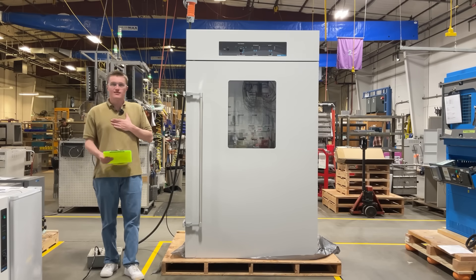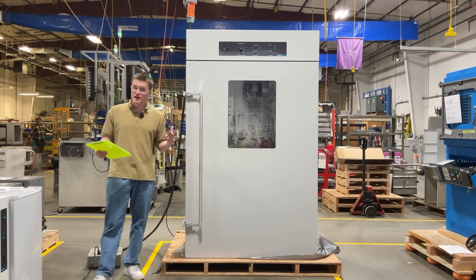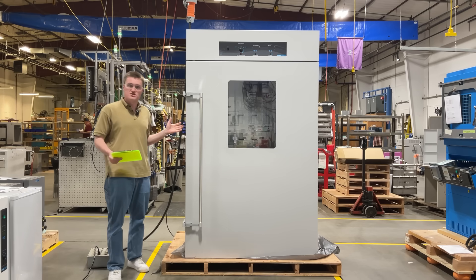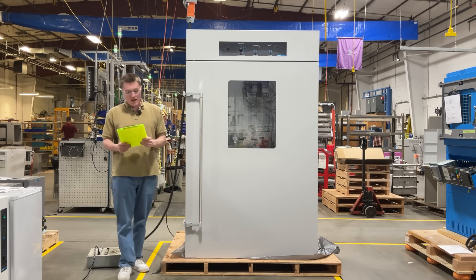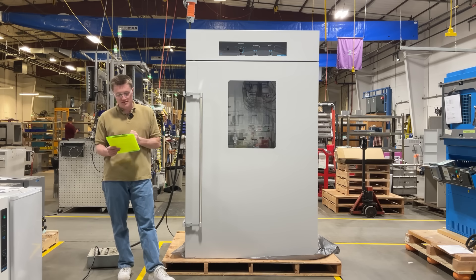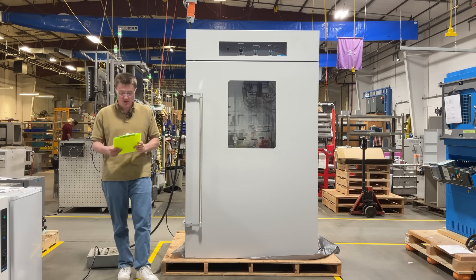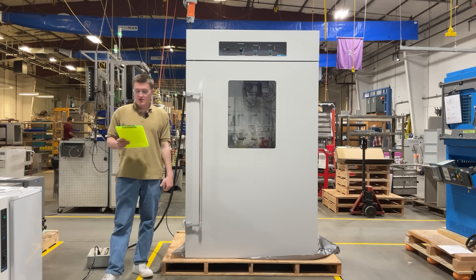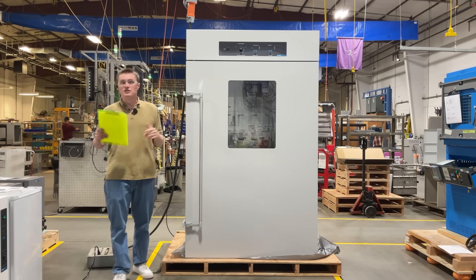Hello again, my name is Kord Sangste. I'm a design engineer here at Sheldon Manufacturing, and today I'm introducing the FCO 58 CO2 Dry Incubator, a high-performance solution designed to meet the most rigorous demands of life science researchers, biotech professionals, and clinical laboratories. In the world of scientific research, precision, reliability, and contamination control are non-negotiable, making this product ideal for your needs.